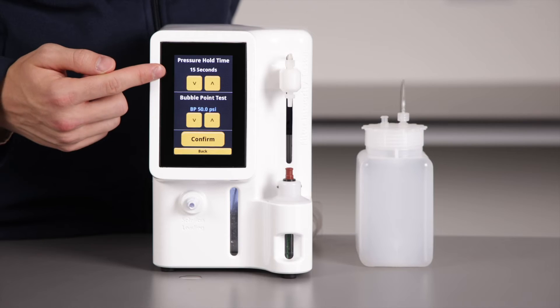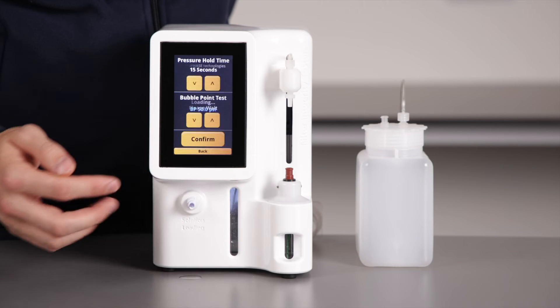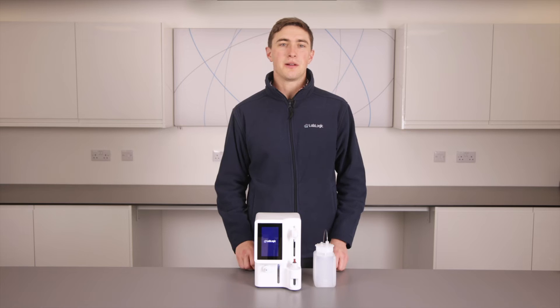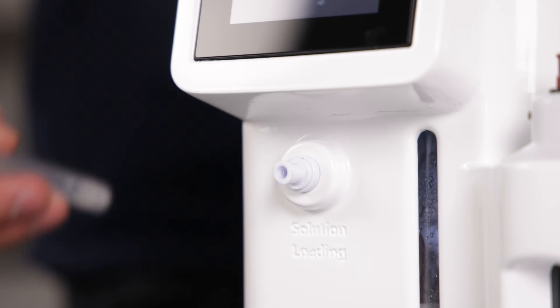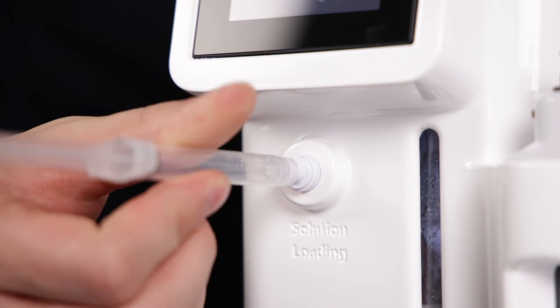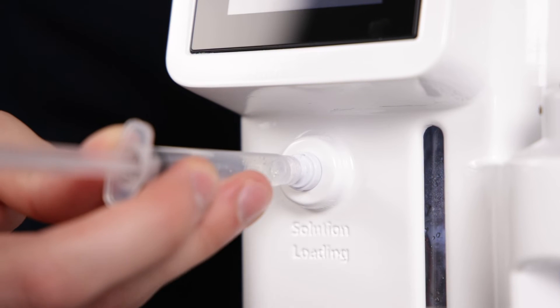We will decide the parameters based on the SOPs. Here, I have chosen a 15 second pressure hold and a bubble point at 50 psi. Once we select confirm, the unit will prompt us to purge the system of any residual liquid. We will then add the wetting solution — initially as little as 3 mL, but up to 35 mL can be loaded. Here, we load a standard 15 mL.